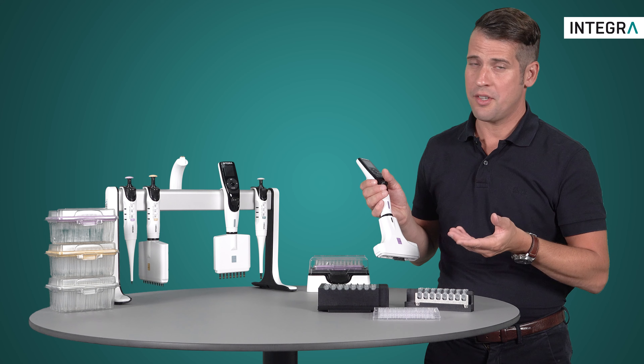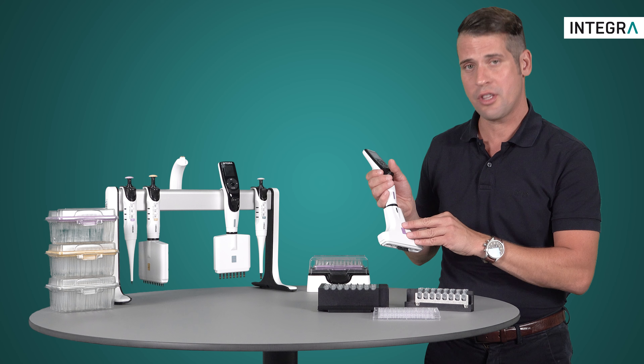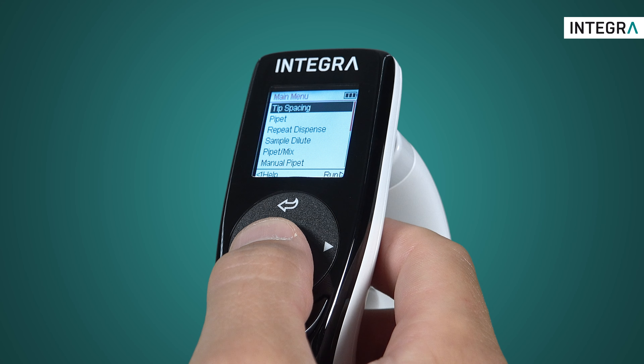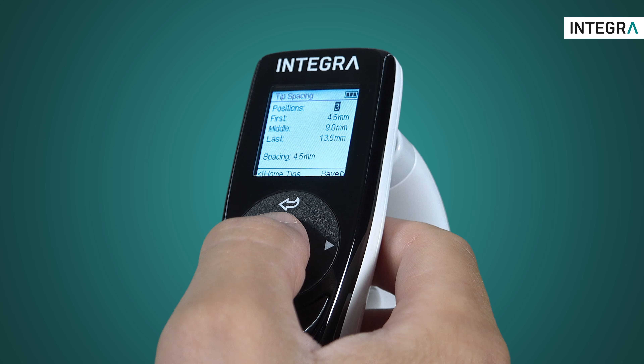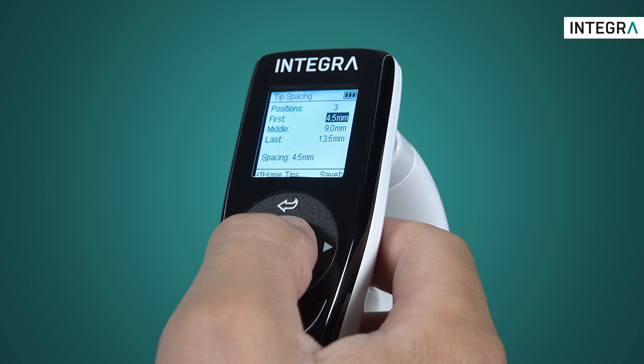The point of this video is to demonstrate how simple and easy it is to set tip spacing using the Voyager. First, enter the tip spacing screen from the main menu. From here, you can save either two or three defined tip spacing positions. Once you've defined how many positions, you can then save what the tip-to-tip spacing should be.